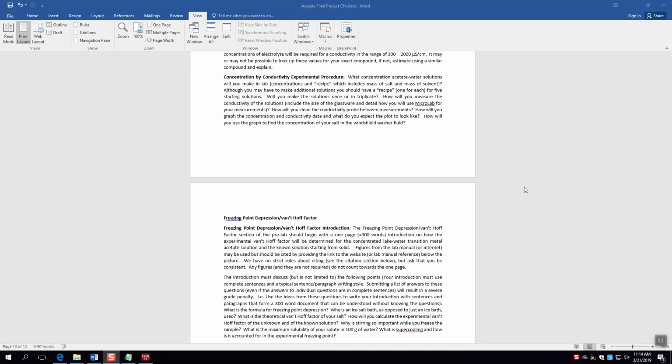In the freezing point depression experiment, Tim and I showed you, I think Tim did, actually showed you in real life on a video how to make that ice salt bath. If you want to refer to that, you could watch the video again and see that. But I'm not going to talk about that in great detail here. The purpose of this video is to give you a general idea of what's going on, but not to give you every single exact detail.